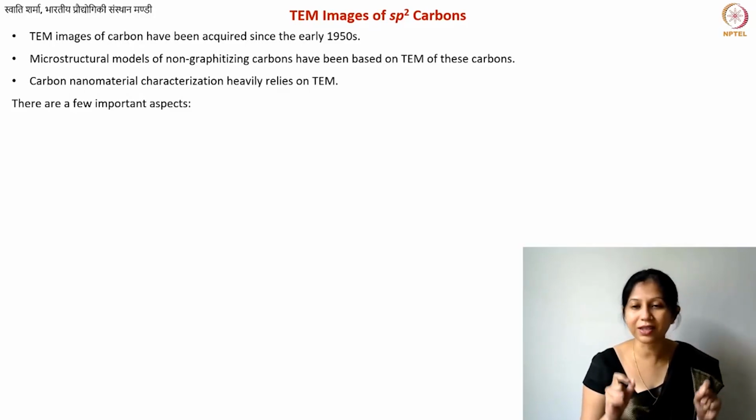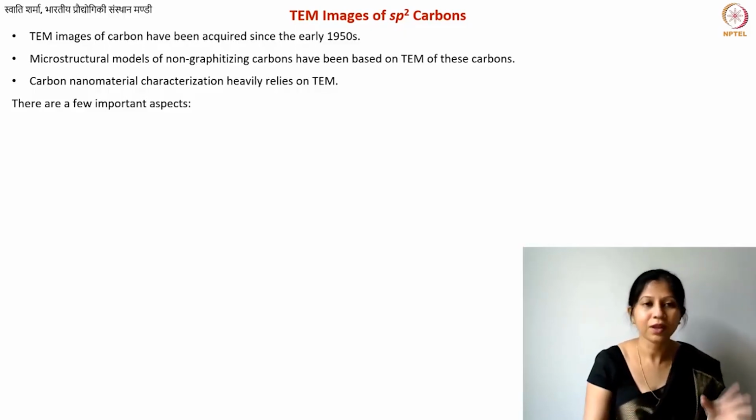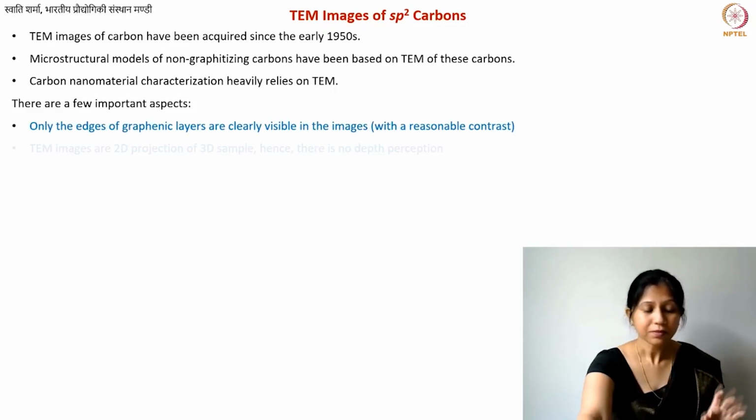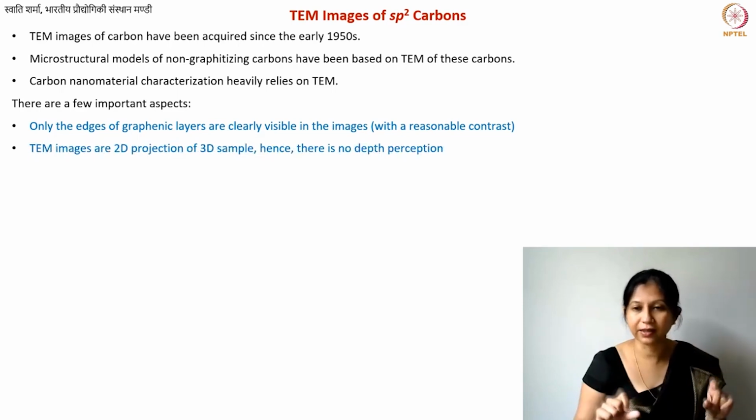But there are also certain things that we need to take care of. So when we are interpreting the images especially, at that time a lot of things become important. That is what we'll now discuss. So these are some of the few important aspects. These two aspects I have highlighted.